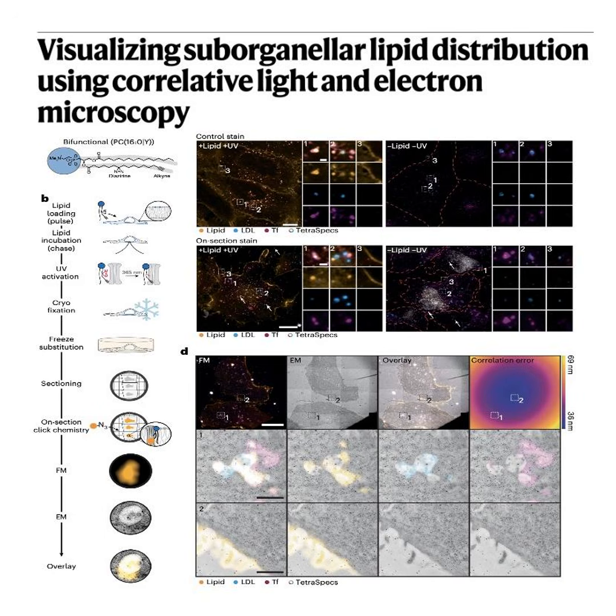What about the physical mechanics, though? Does the cell's import machinery still work with these tracers sitting in the membrane? Flawlessly. They quantify transferrin uptake, or Tf for short. And transferrin uptake is like the classic proxy for monitoring receptor-mediated endocytosis, right? Like the cell pulling materials inside. Exactly. And the Tf uptake was completely unchanged. They also looked at clathrin-coated pits, which literally fold the membrane to bring things in.